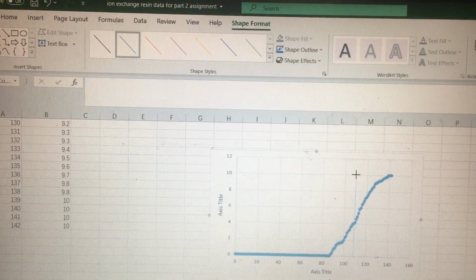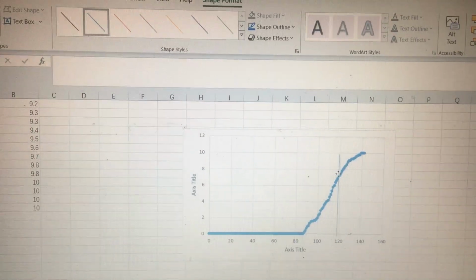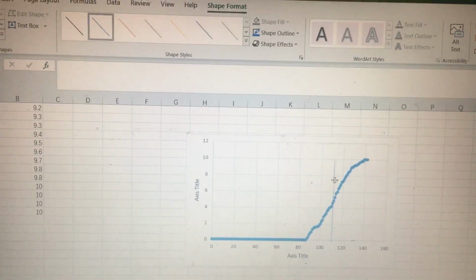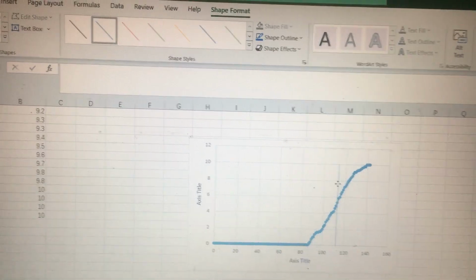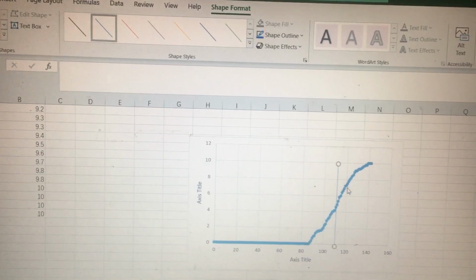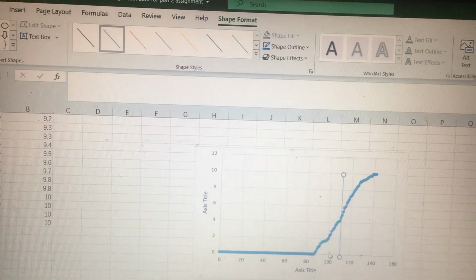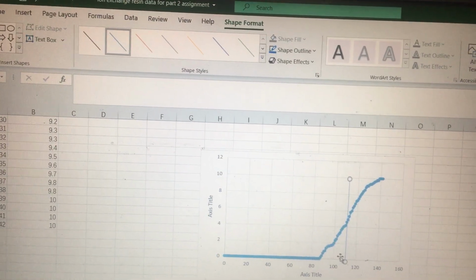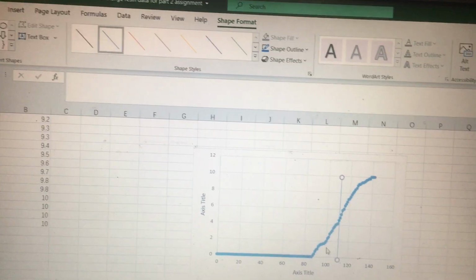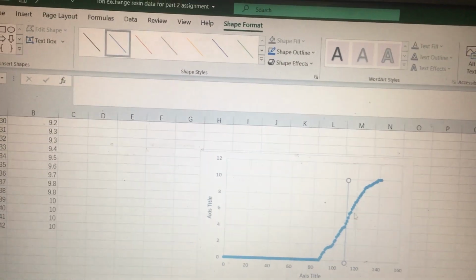and then we just keep moving this vertical straight line left and right until we can make sure that the area here, the A1, as I showed in your lecture, equals A2, the area here.